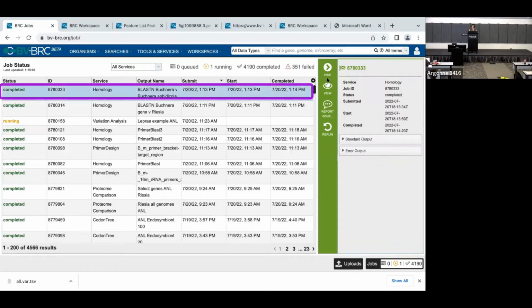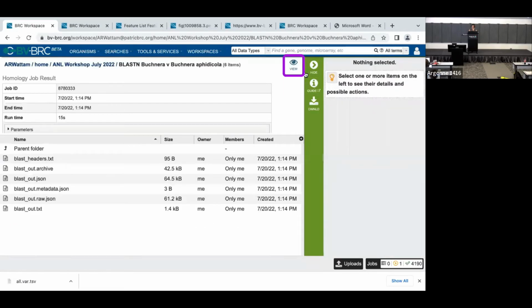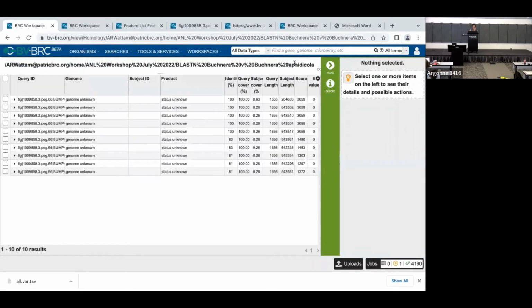So I click on this and I click on view, and then I click on the blue eyeball that's staring out at me from the upper right. You notice how briefly it said no results found and then overwrote the table. And so this is telling me, here's the query ID. Oh, here's this same bug. This is a bug that we know about, but it hasn't been fixed yet, that shows us the genus and the contig that it's on.